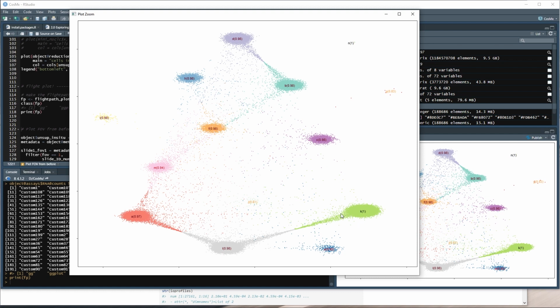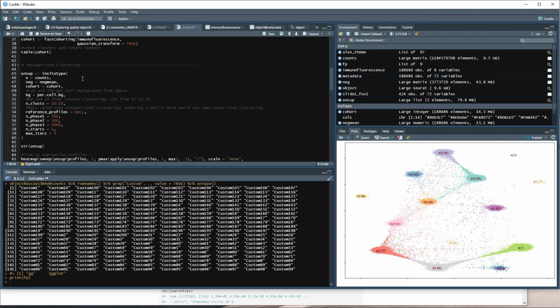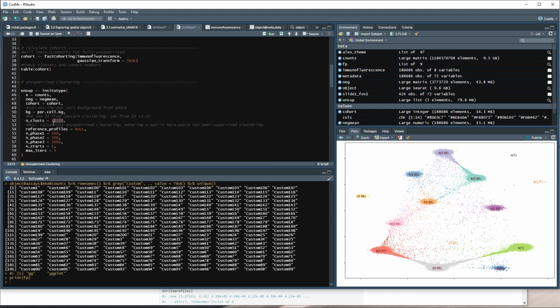If you have a lot of webbing between all of the cluster centers, it might be worth digging a little further into why that's happening. Perhaps there are some probes that are failing, and for whatever reason it's not allowing InSituType to identify differences between cell clusters, or you have not provided a good range for InSituType to search within.